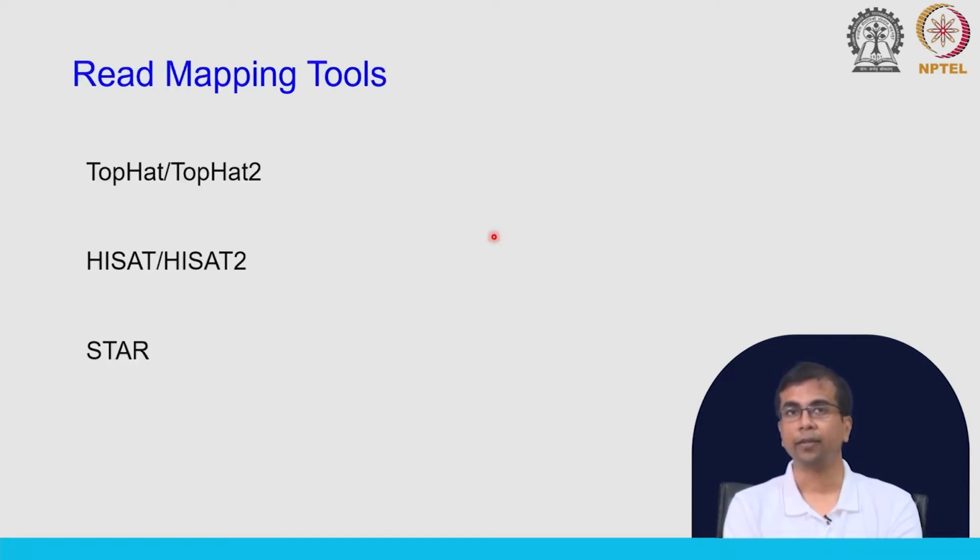There are tools that have been designed to do this kind of alignment. One is called TopHat or TopHat2, which is one of the earlier tools. It is based on the Bowtie2 or Bowtie program, an extension of Bowtie using the Burrows-Wheeler transformation, and it was very efficient and fast, but now it is not used that much. Then we have the class of tools called HISAT or HISAT2, which is also quite widely used now, and you have STAR.